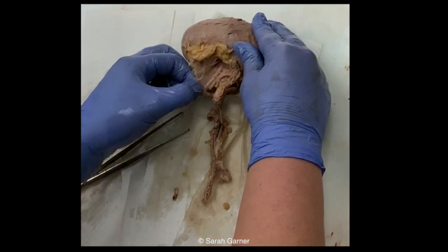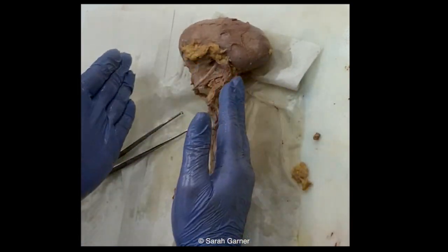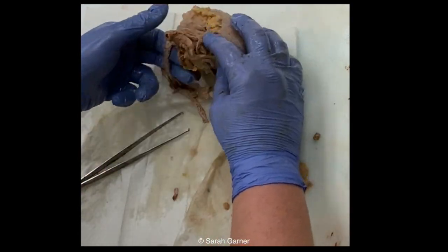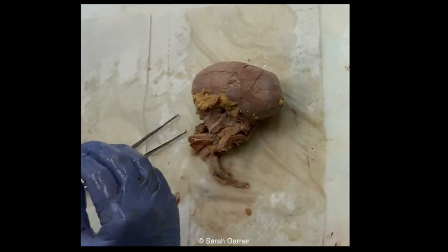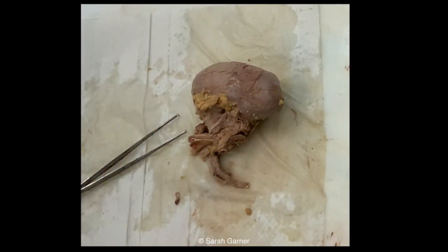Okay, so now you should weigh it before you start cutting anything. At this point, you can go ahead and trim off your vessels and any excess fat, and then you can go ahead and weigh it.